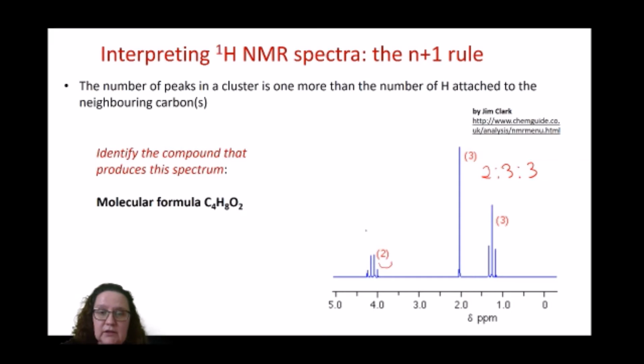So here this multiplet corresponds to a CH2. Here this singlet corresponds to a CH3 group, and this triplet here corresponds to a CH3 group.